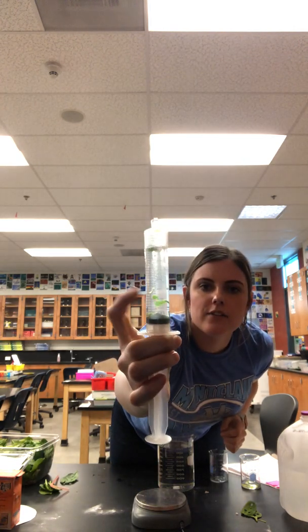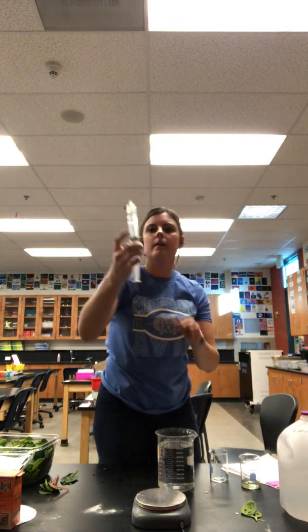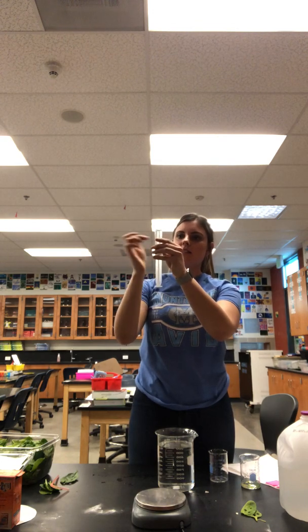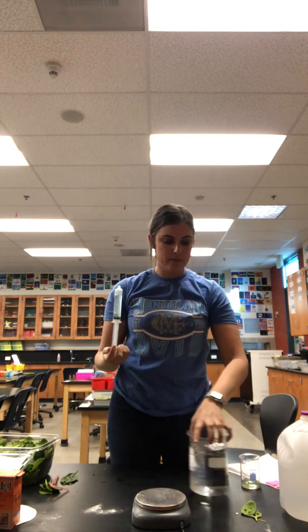And so like I said, a lot of them are starting to sink to the bottom. And once we have at least most of them, there's the last one. Once we have at least most of them to the bottom, we're going to then take our small beaker, and this is where we're going to separate into our two groups.